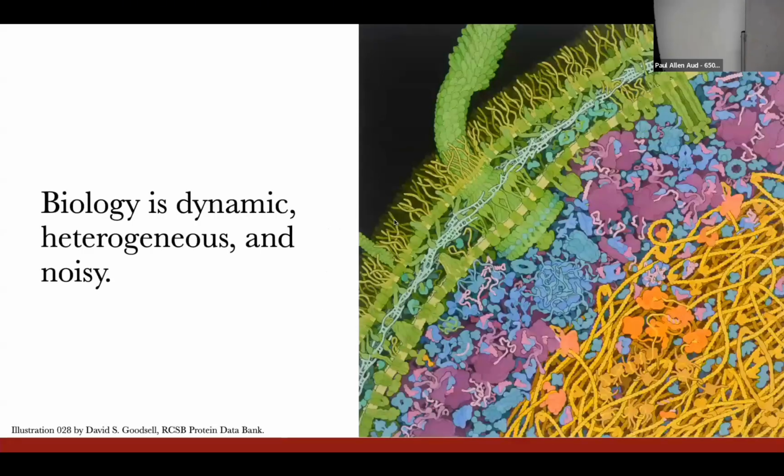So the main challenge for optical microscopy in the biosciences is that amino acids, proteins, cells, the things that you and I are made of, just don't interact very strongly with light. Not only that, we have to do our measurements in these environments that are warm, wet, and often alive. And so what that means is that being quantitative, precise, and accurate is very challenging.